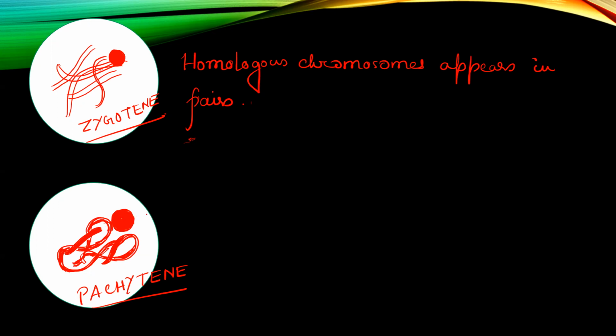So if you see these features, you will identify the substage to be pachytene. What is very important?